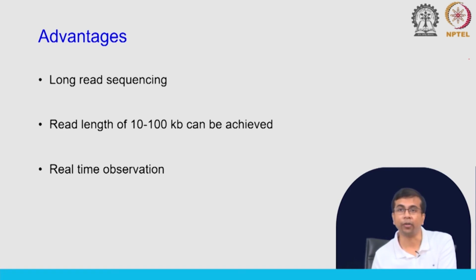In addition, this is also a single molecule sequencing, right. So, we are getting the signal from a single molecule, right. Like SMRT, we are sequencing one molecule and each nanopore will get a unique DNA molecule. So, this is again really advantageous, because we can now identify what are the changes in the DNA molecule just beyond the bases. Okay. What if there are some other modifications or some specific characteristics? Those can be identified because we are now observing these single molecules in real time.